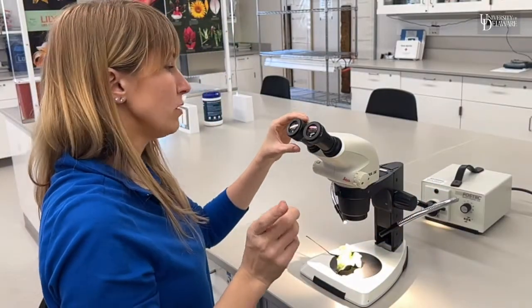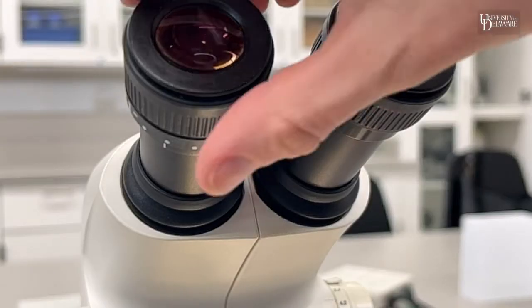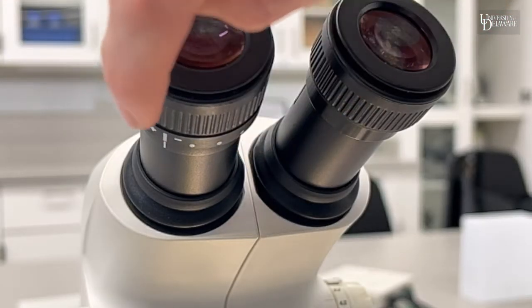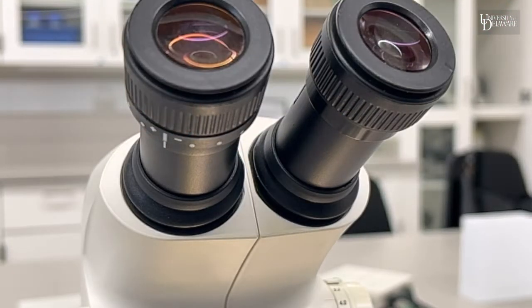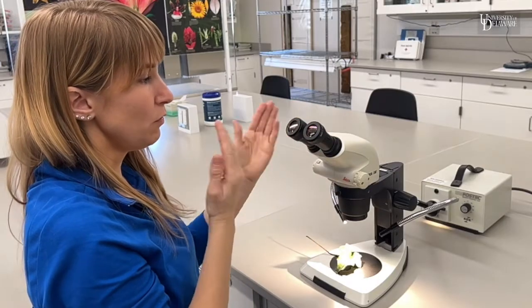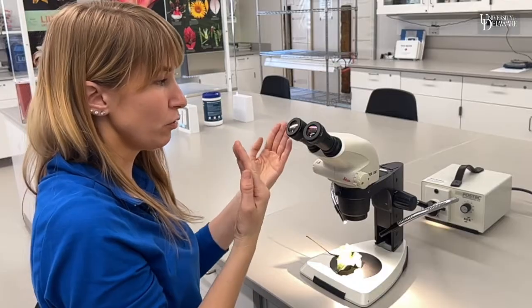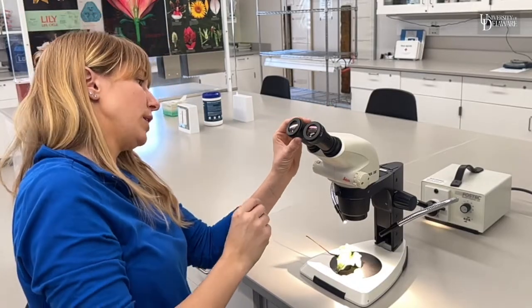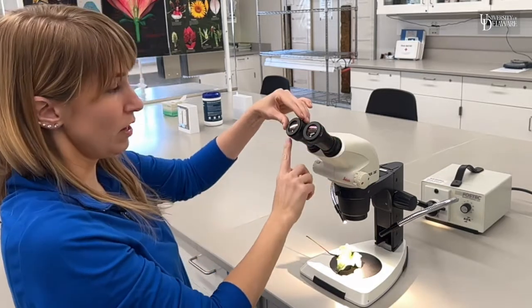The other thing that's really important: the left eyepiece usually has two lines that you need to line up. That makes sure the focus on both eyepieces is the same. They do this because if you have drastically different prescriptions in each eye, you can adjust it to yourself. So the first thing you want to do is just make sure those lines are lined up.